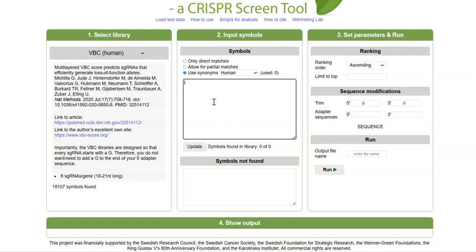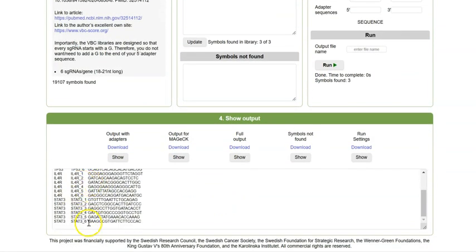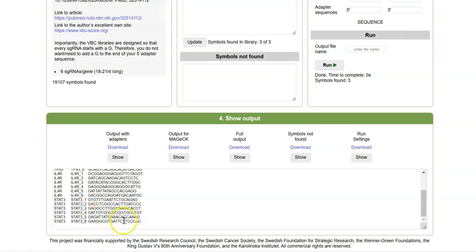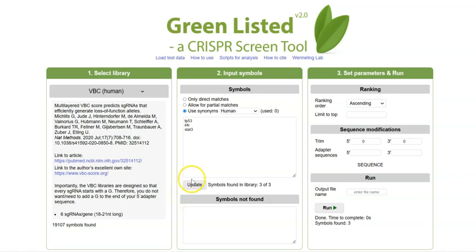So you can see if you add a number of genes here, so this is human, so let's call it TP53, IL4 receptor, STAT3, common. You'll see that all of them are starting with the G, right? Boom, boom, boom, boom, boom, boom, boom, boom, boom. So there's always going to be a G there. And this has a practical application that I want to highlight.